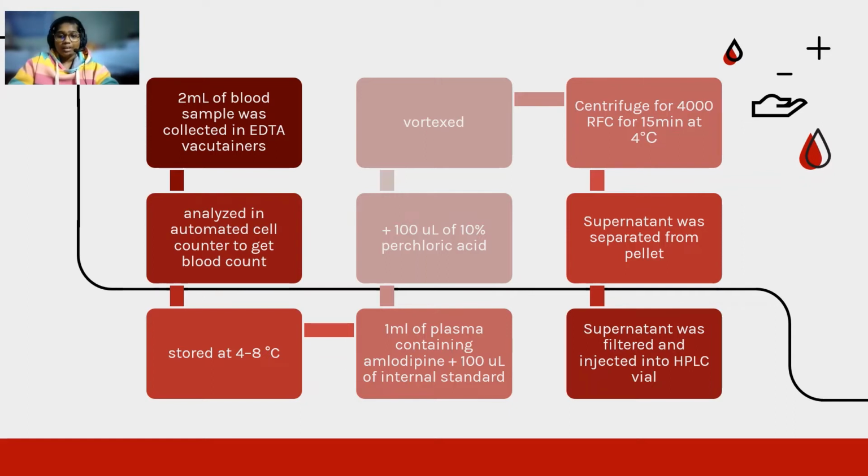So the supernatant will be separated from the pellet. The supernatant is then filtered and then injected into the HPLC vials.